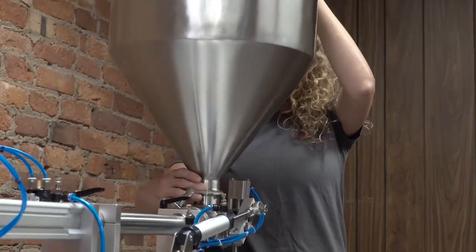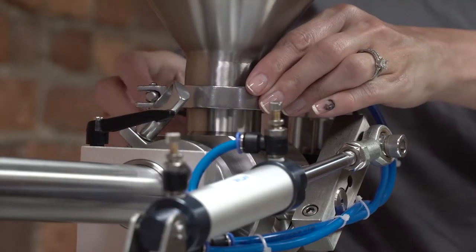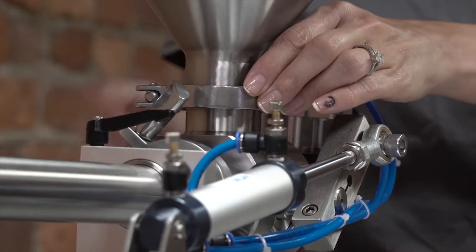Reinstall the hopper gasket and then the hopper. Install the sanitary clamp. Make sure all clamps are hand tight.